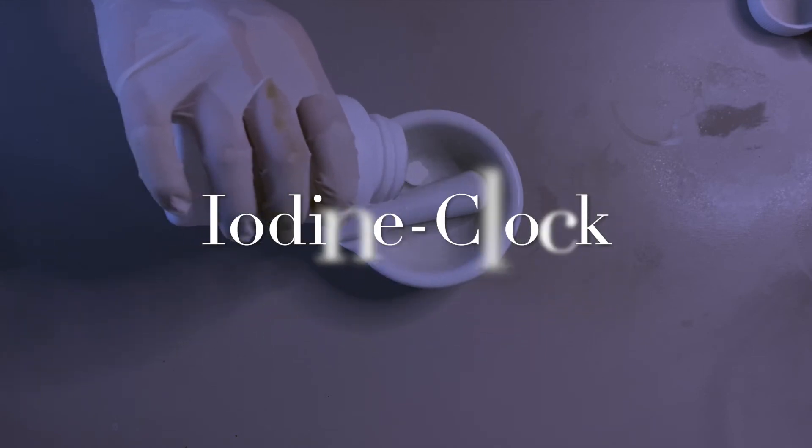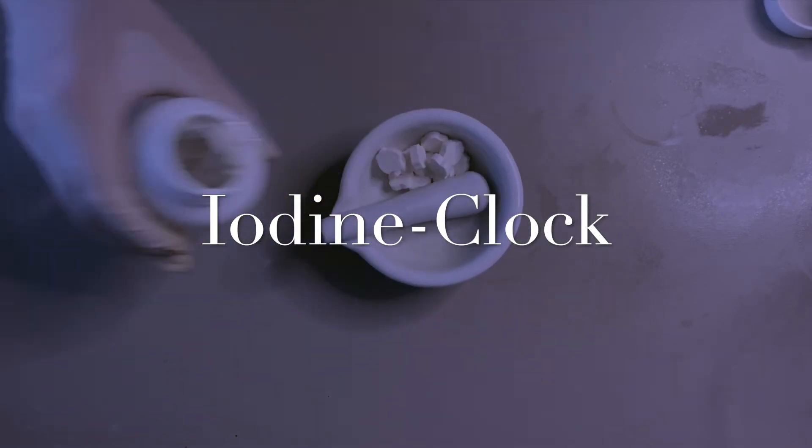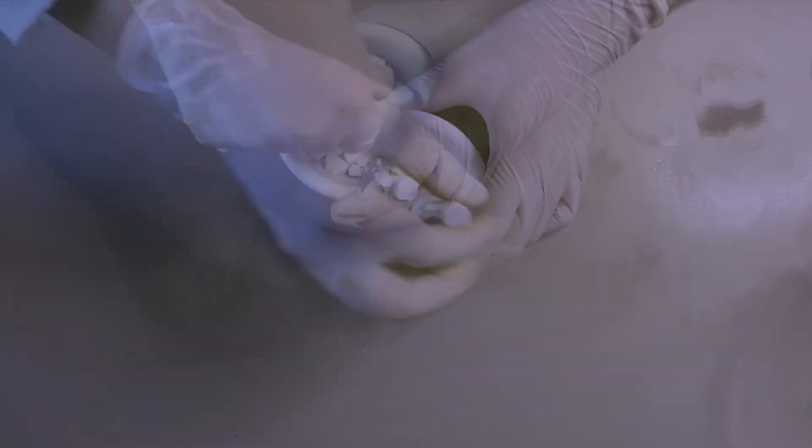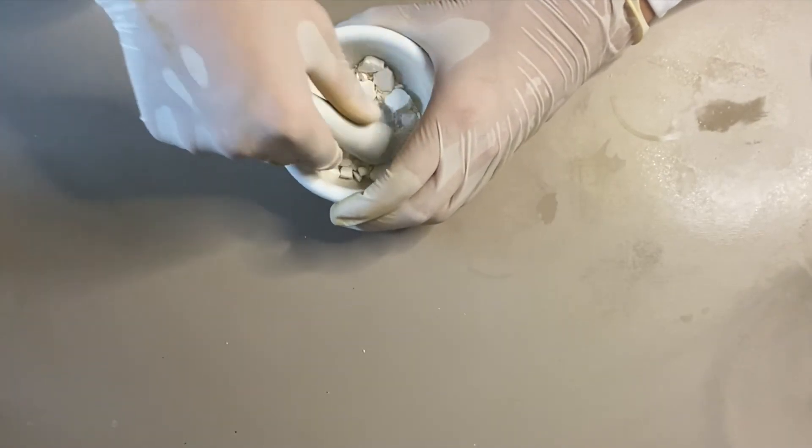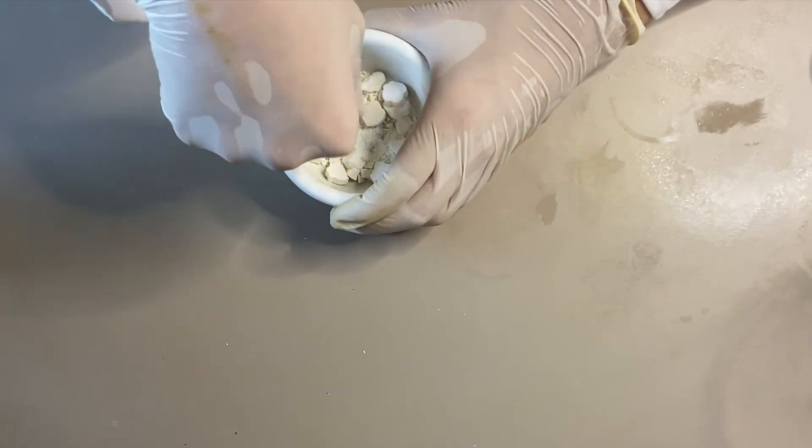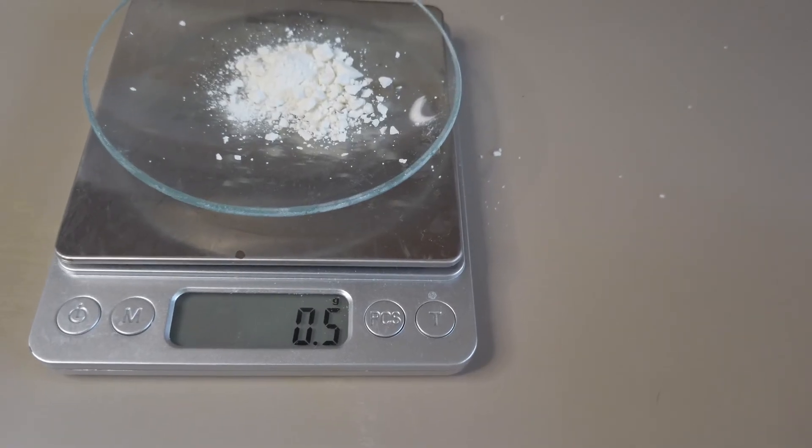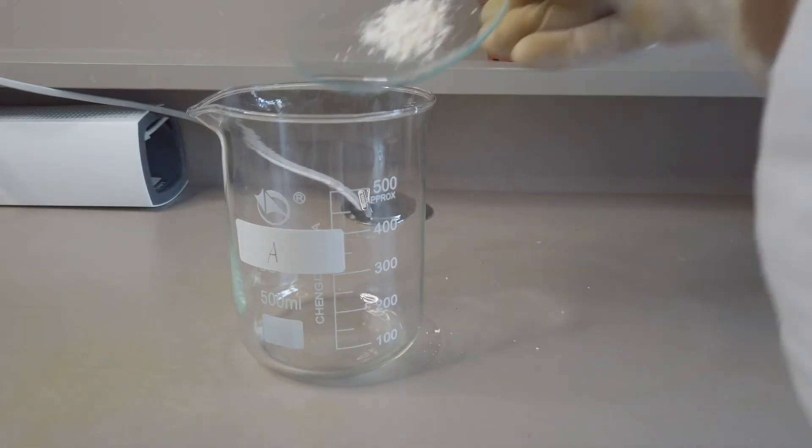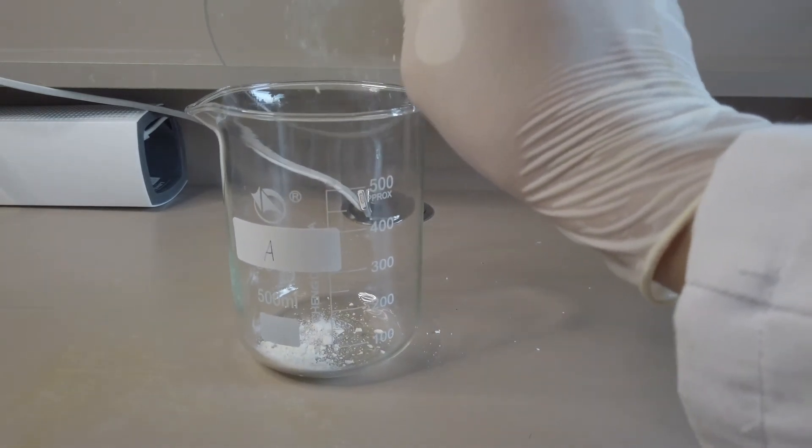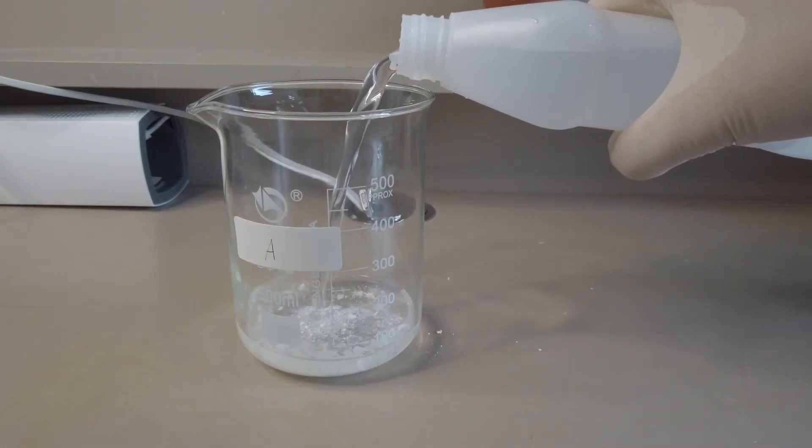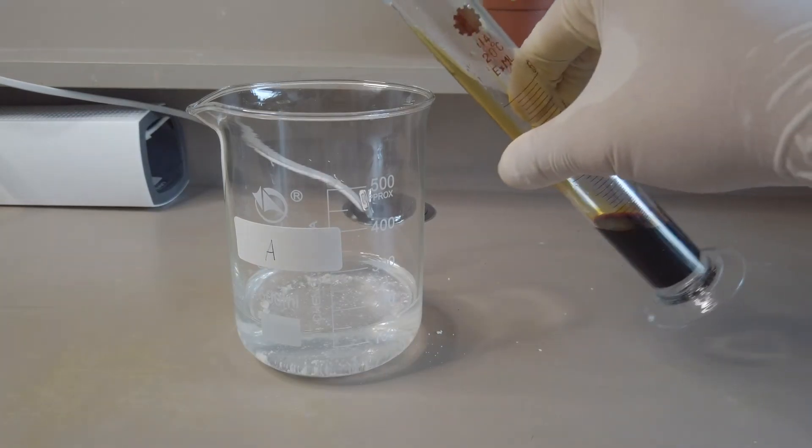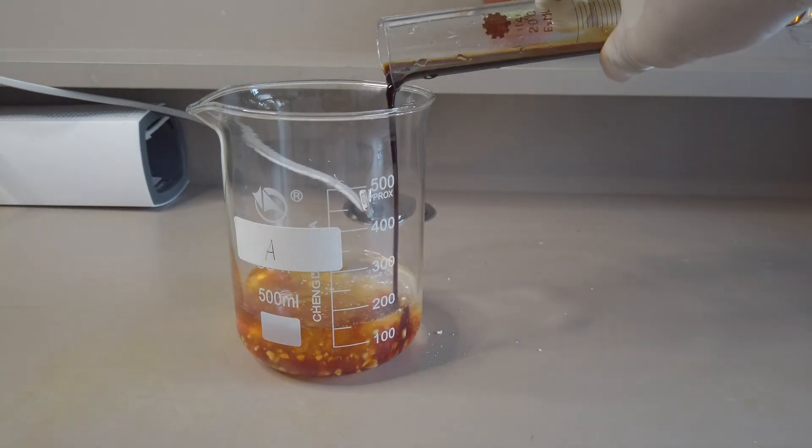Now comes our third experiment, the famous iodine clock reaction. To begin with we crushed some vitamin C tablets into powder. Then weighed out 0.5 grams of the powder. Into the first beaker the powder was made into a solution by adding 100 milliliters of distilled water. Then we added 12 milliliters of povidone iodine.